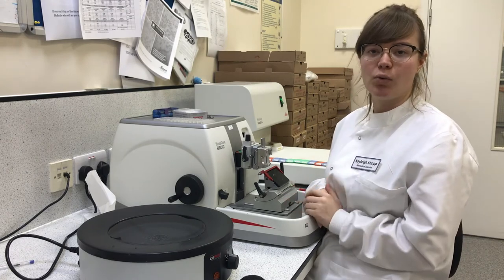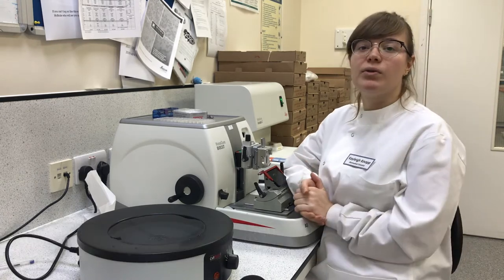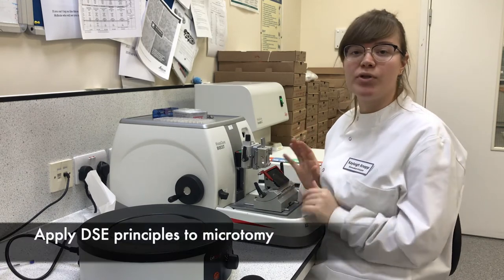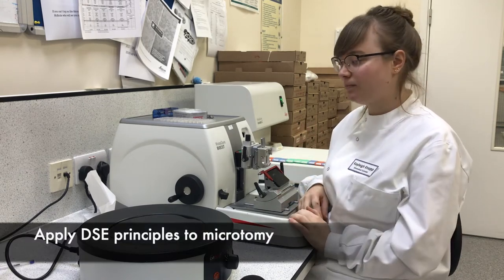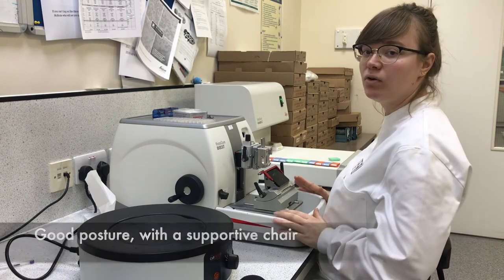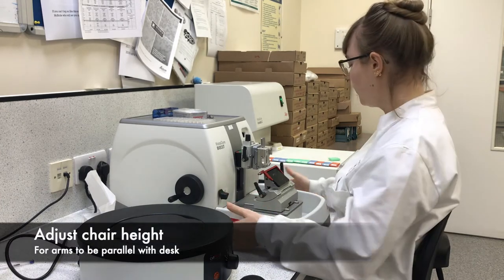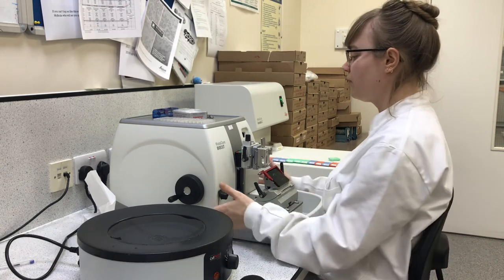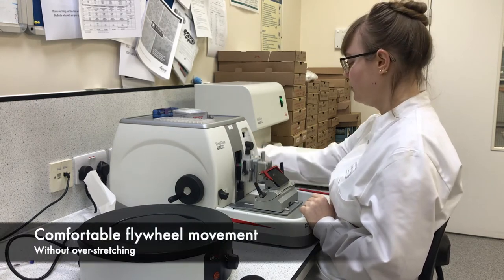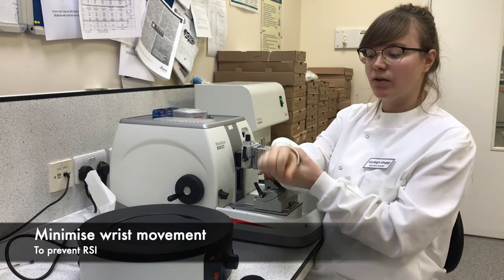Now we're going to talk about how to set up your workstation — this is very important to prevent repetitive strain injury. We apply the same principles as a DSE health and safety assessment at a computer: sit with your back straight, on the correct chair, with your feet on the floor. Make sure your chair is at the right height so your elbows are level with the table, and be directly in front of your microtome. When turning the flywheel, make sure you don't overstretch your arm or make excessive wrist movement.